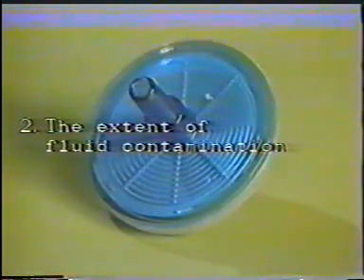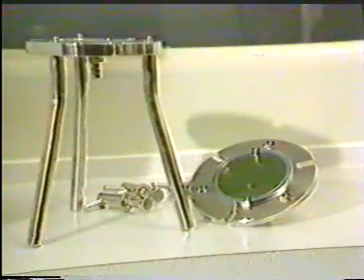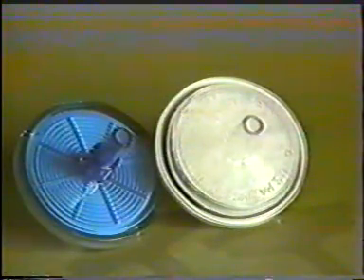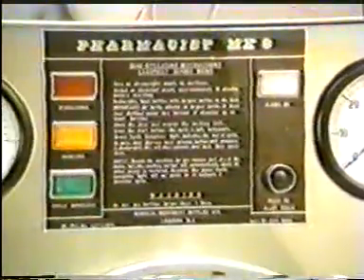Membrane filters are presented in disc or cartridge types. The advantage of a cartridge type is that there is a large filtering surface in a smaller package. The type of filter chosen depends on several factors: the viscosity of the fluid, the extent of contamination in the fluid, the degree of filtration required, and the volume to be filtered. Large filters may need to have supportive frames, which also allow for the use of attachments. Small filters can be purchased as a pre-sterilized unit, ready to connect with syringes or tubing.